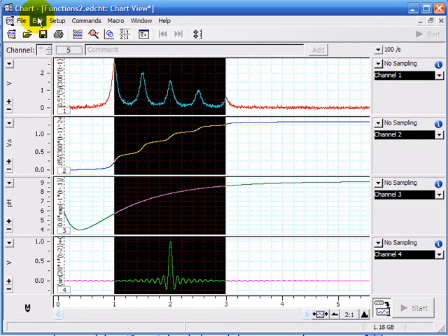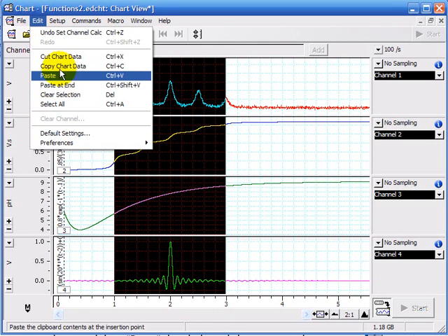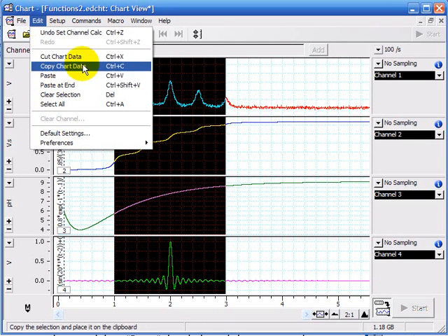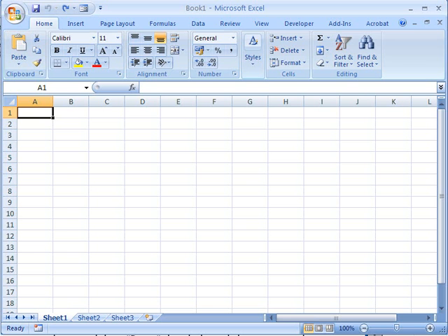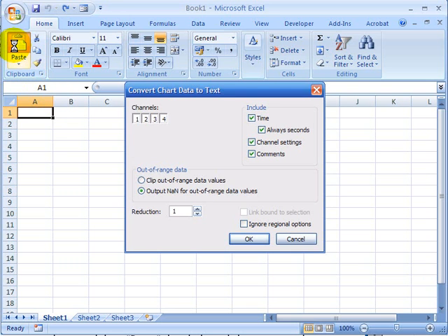You simply go to edit and copy, you can do Control C, and open up for example Excel and you can paste that in.